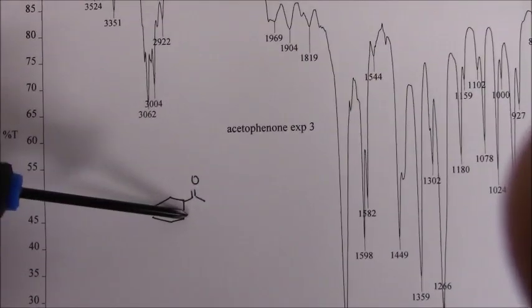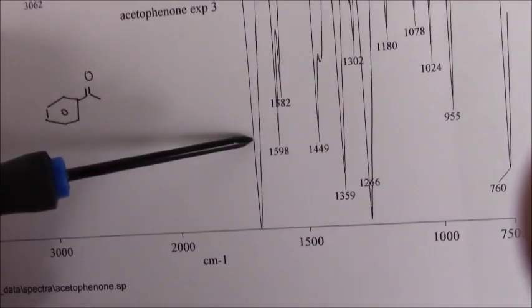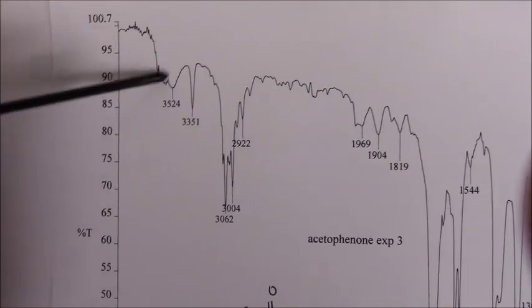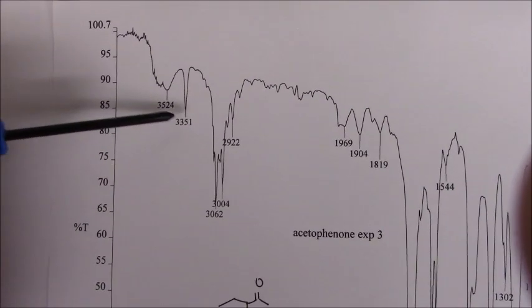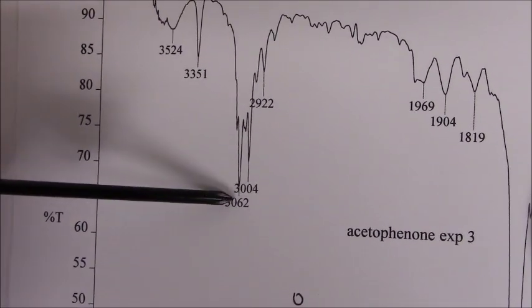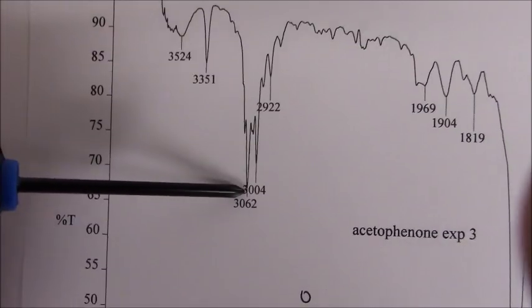Infrared. So acetophenone, always draw the structure. So for this one, you've got a carbonyl, and it's this one, which was not picked. You got to make sure it's picked. It's right around 1710-ish. That's your C double bond O stretch. The overtone, you only circle it if you see it. It's a nice short little spike. If it gets obscured by something else, obviously you don't circle it. These peaks here, and it would have to be the ones over 3000, would be CH stretch, but the C is sp2 hybridized.